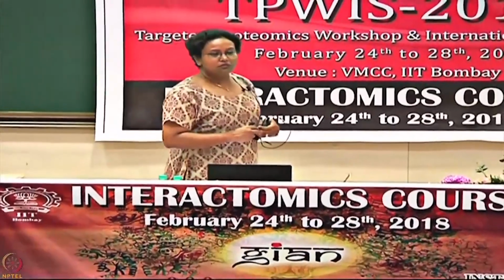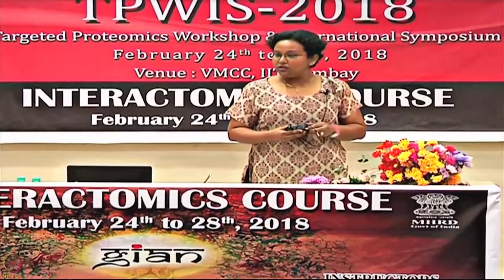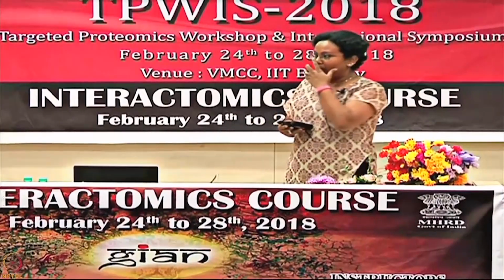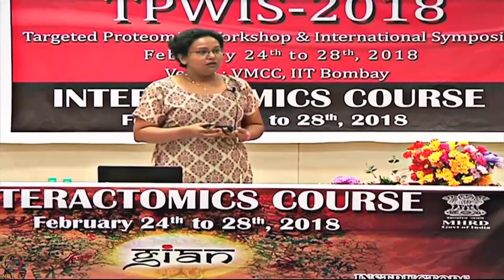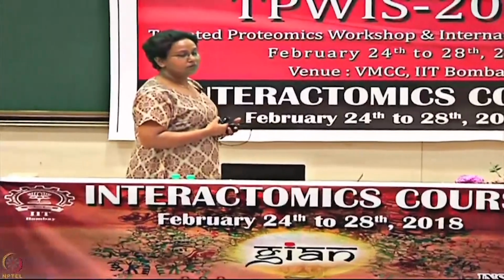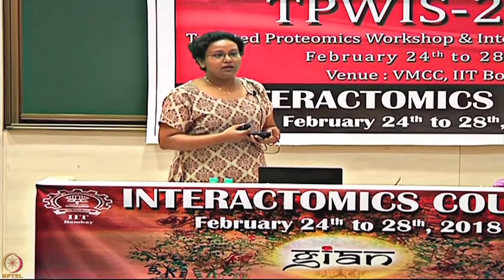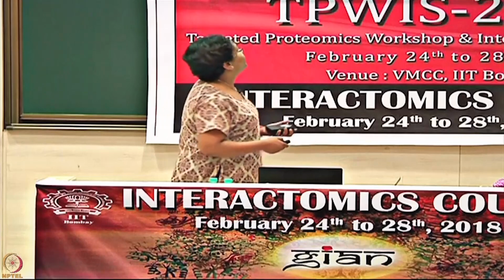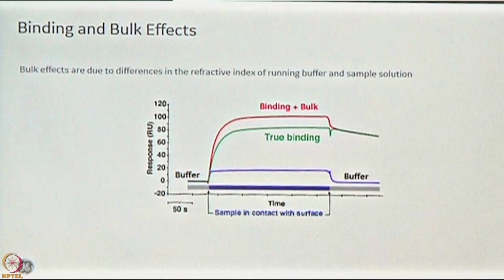This is rather a simple thing, it is just that you are passing your analyte over the ligand that you have prepared. Now, if you remember, we talked about that SPR is actually a refractive index measure, right. The change in mass causes a refractive index change, which you are reading, and so a difference in concentration in your buffer would also change the response unit that you are reading. So, what we call a bulk effect: when your analyte is in a particular buffer, the buffer also gives you some response unit.